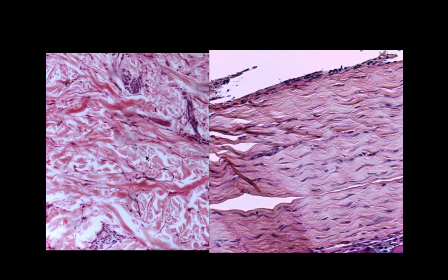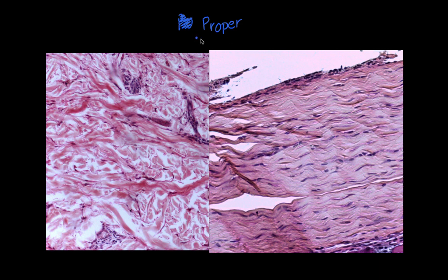I wanted to compare dense irregular to dense regular connective tissue, just to hammer the point home about collagen. These are both connective tissue proper — specifically dense connective tissue proper. We have dense irregular on one side and dense regular on the other. The collagen fibers on the irregular side are going every which way, versus the regular side where the collagen fibers are going straight across.